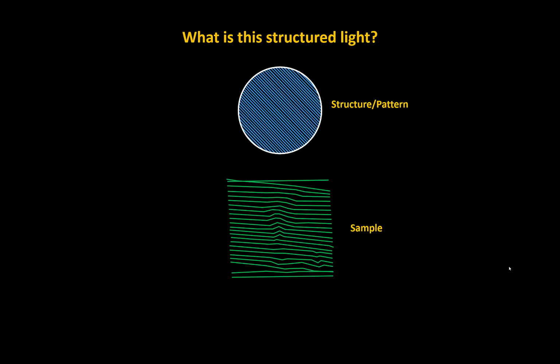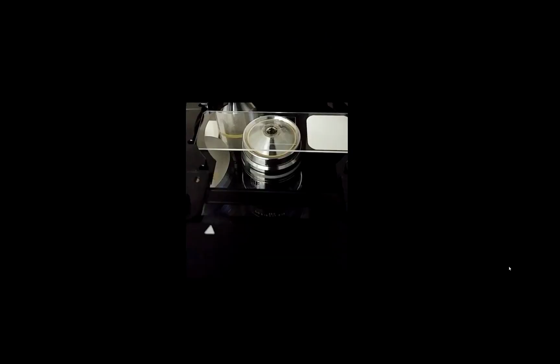We're not changing the optics substantially, although there are definitely differences in the optics compared to a wide field. But the approach for doing this really only requires that we take a few different images. All of the actual structured illumination microscopy magic will happen once we've taken the images and we need to actually reconstruct that image.